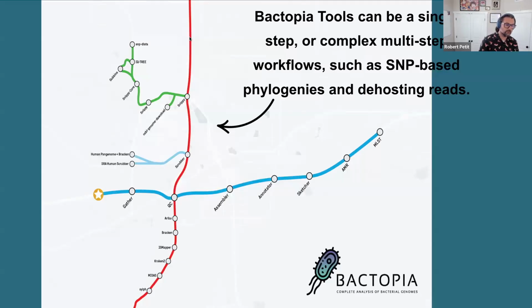To me, I wanted to create something simple where I just change one parameter and I can run another tool, change one parameter, I can run another tool. Because oftentimes we may be in the lab and just want to do a quick test, and this allows us to do that. Similarly, all these pieces can be picked up and rearranged in the pipeline. It's kind of like the little kid's toy where the triangle goes in the triangle slot, the circle goes in the circle slot. But then you will have somebody that will try and put the square in the circle slot. Sometimes it works, sometimes it doesn't.